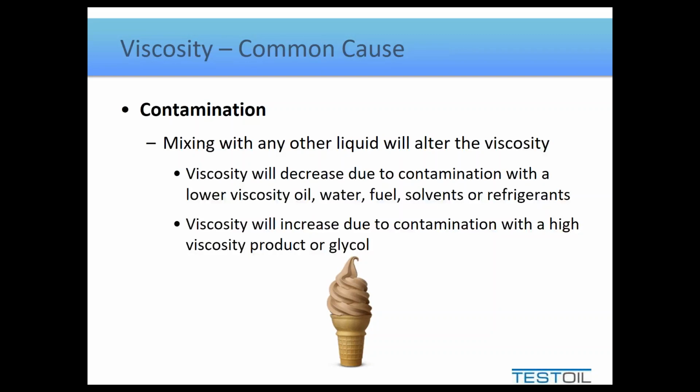and in doing so, it will trap little air bubbles. And that's the reason I've chosen the picture of the soft serve ice cream cone and why I chose the chocolate flavor. I've often joked that a Wendy's Frosty, which is basically chocolate soft serve ice cream, kind of looks like that picture. That's what glycol in oil looks like.